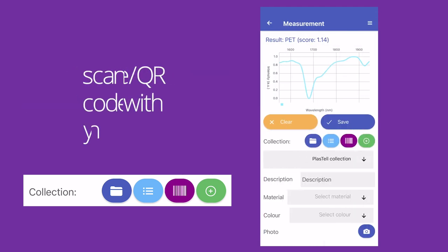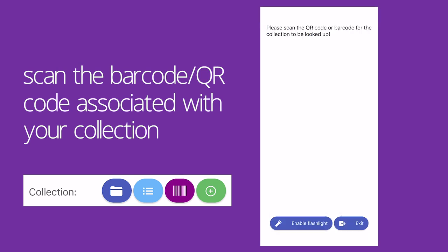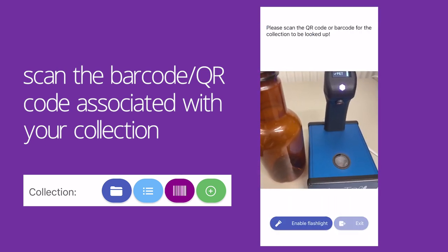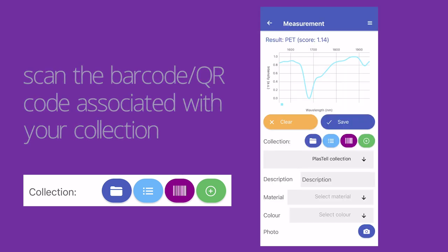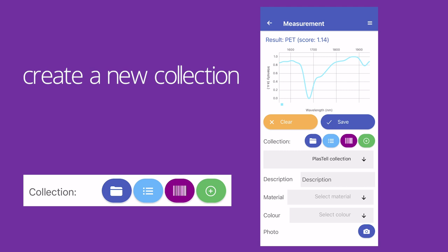The purple barcode button allows you to scan the QR codes associated with your collection. The green plus button creates a new collection, which you can then save your measurement to.